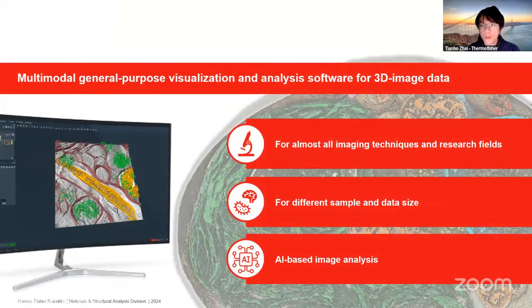The number one takeaway, I hope, from my presentation is that please consider AMIRA software as a standalone image analysis software. That means the software doesn't need to be attached to a particular instrument or brand of instrument, and it takes in a variety of images coming from however many instruments you may think of.